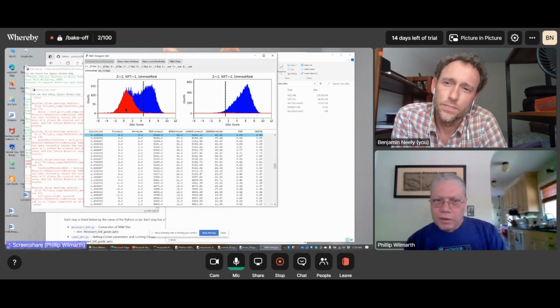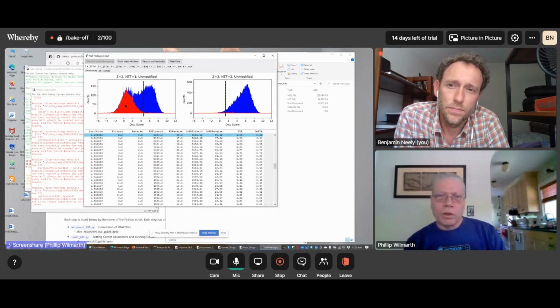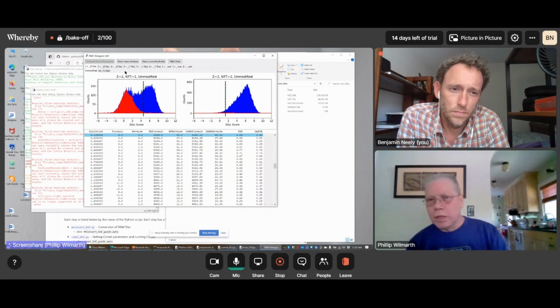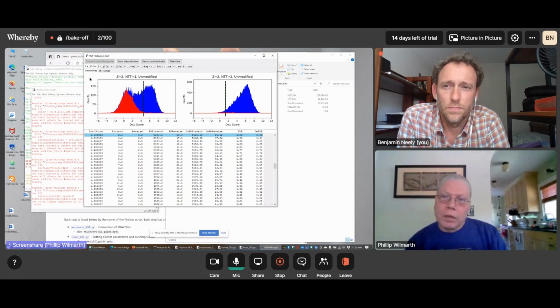And our noise, the red distribution, our decoy peptides, partition sort of as a function of the search space size. So if we've got a large search space size like phosphorylation, we're going to have a lot of noise in that category, and that's going to require a higher score threshold to get a 1% FDR than our unmodified peptides. Oxidized methionine is pretty close usually in score cutoff to the unmodifieds, but we separately look at histograms for every PTM that you specify. It's one of the reasons you don't want to specify too many PTMs, because it makes the statistics start to get a little bit sketchy.